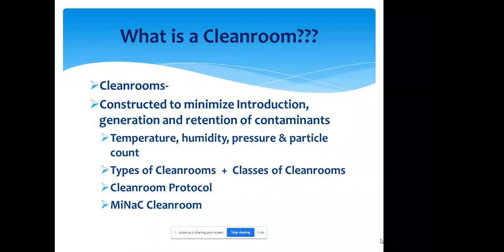There are different types of clean rooms, and the clean rooms are also segregated according to classes. And therefore, in order for you to maintain what it is that you set out to build, you have to have a certain clean room protocol that you're going to adhere to.